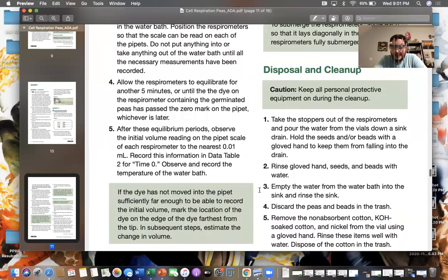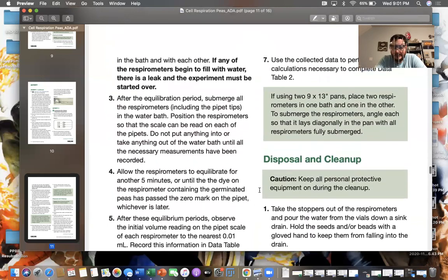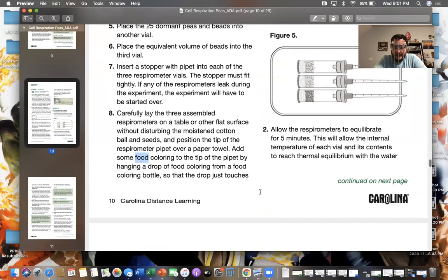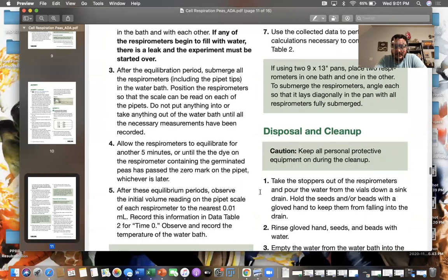Okay, so actually it looks like here you are going to want to use dye if you have it. I probably do have it somewhere, because it's going to help you observe the differences in the gas. So it's worth doing if you have it.